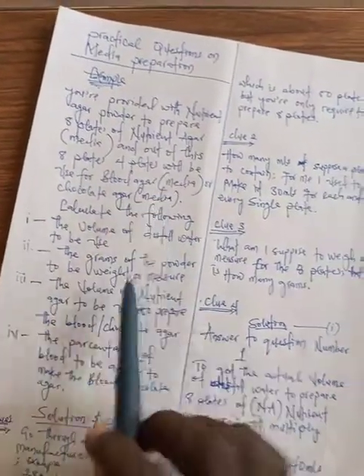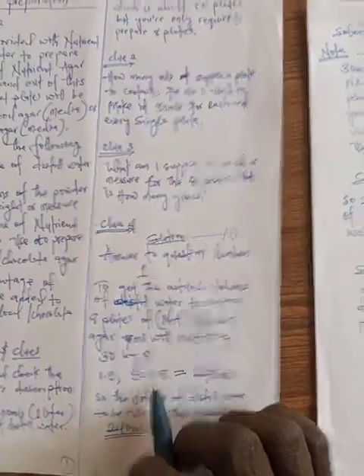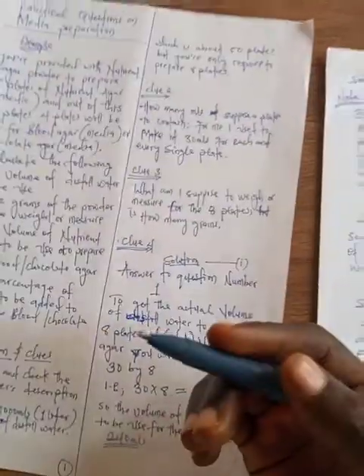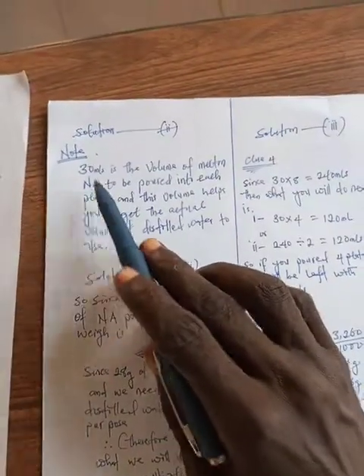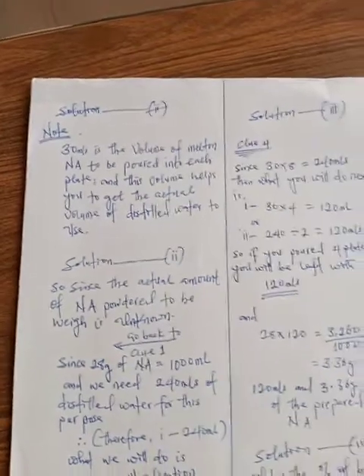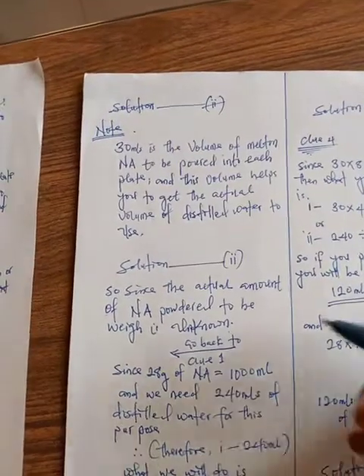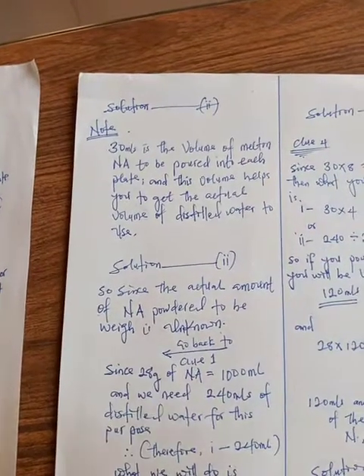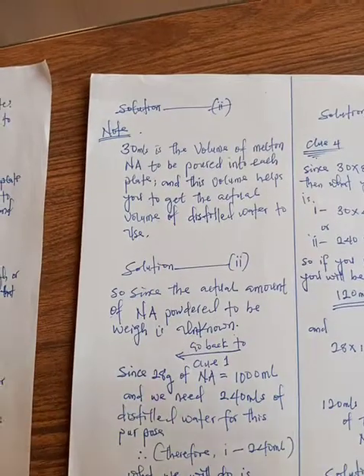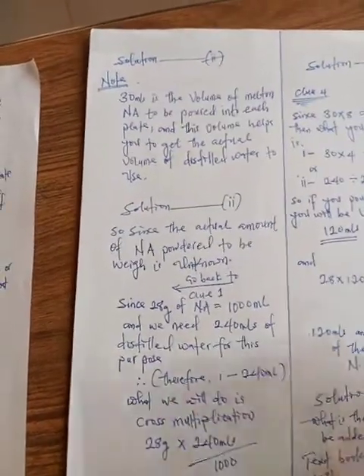Now you have answered the first question. The first question says the volume of distilled water to be used, calculated. What you just did is, since one plate contains 30 mls, you multiply 30 by 8 plates, and it gives you 240 for the 8 plates that you are supposed to prepare. So let's come here now. 30 mls is the volume of melted nutrient agar to be poured into each plate, and this volume helps you to get the actual volume of distilled water to use. First of all, you will have to know the volume a single plate is supposed to contain. Then you will multiply it by the number of plates you want.